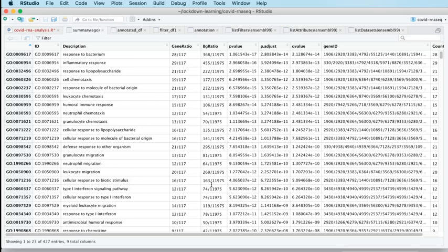So this is quite a nice way of associating the genes in our gene list with some functional terms, some of which look like they might be meaningful in terms of what's going on. It's a response to a virus. Okay, we're getting a response to bacteria here, but there's other kind of inflammatory pathways and things like that cropping up in this particular set, which is interesting.